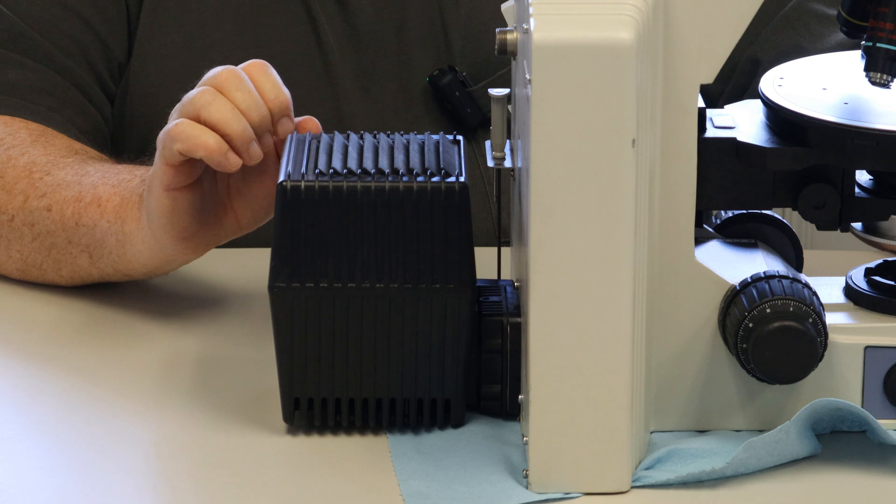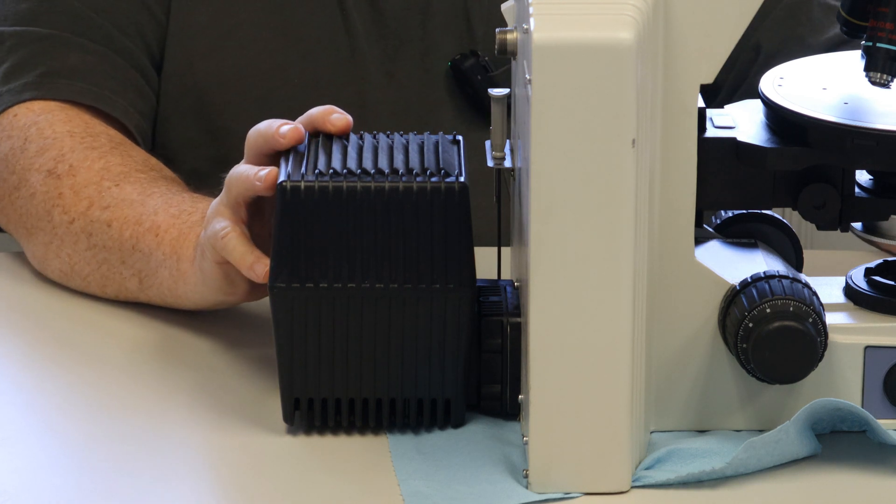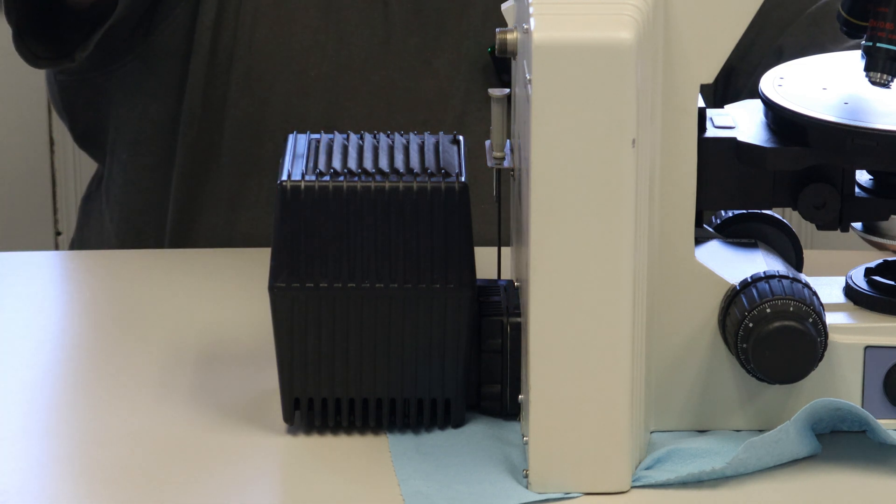Have your scope turned around. This is your main lamp housing. If you actually have an epi set up, you'll have another lamp housing up here.